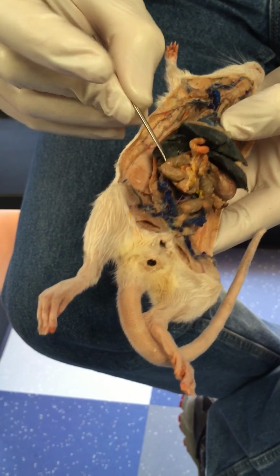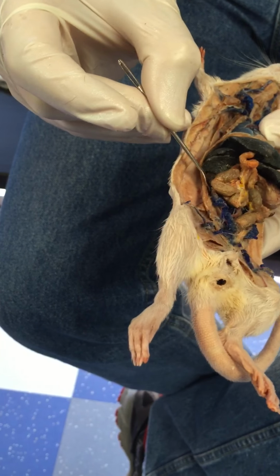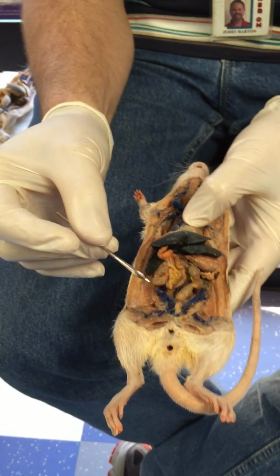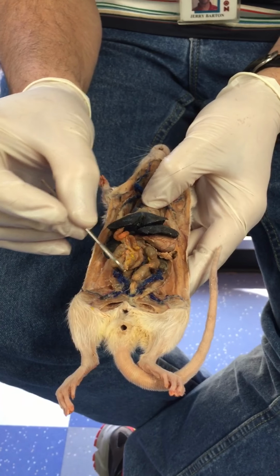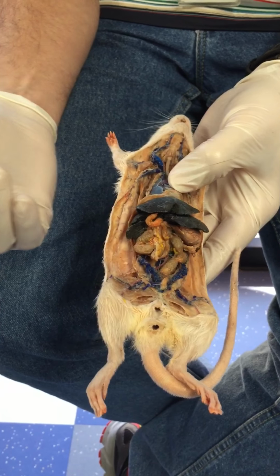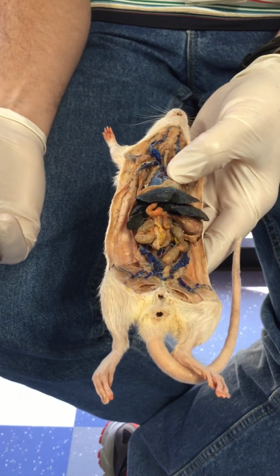And then over here, the other ovary is underneath; you can't really see it. But it's just a little thing, like a green pea, about that size. That provides multiple implantation sites for multiple fetuses, so that's why they can give birth to litters, anywhere from 2 to 12 babies at a time.